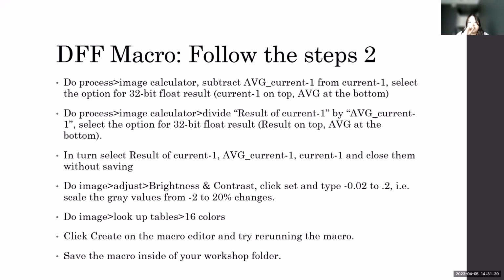Did you subtract stuff from the average, or did you subtract the average from things? I think I subtracted the stuff from the average, so the average from the slices. But I will double check again to see if the order was right. Yeah, because the subtraction order can be a bit confusing, so maybe double check if you did that part. Okay.